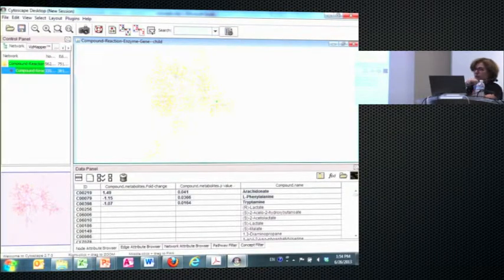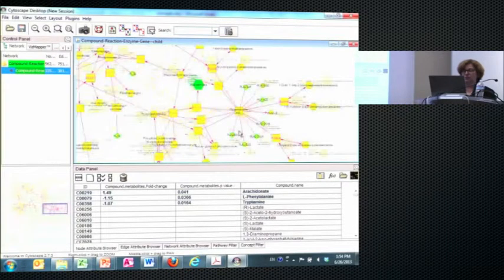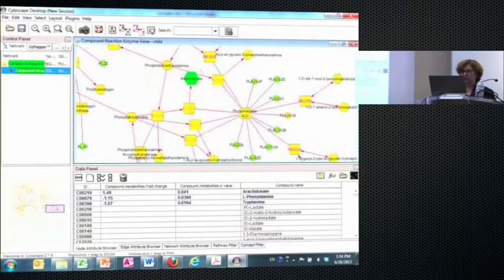One thing that I want to point out is that we don't visually represent in these networks the amount of the change. We tried that. So you can quickly tell that arachidonic acid is up, but from this, you cannot tell whether it's a 5-fold change or a 2-fold change or anything like that. We tried different options there, but it's extremely difficult to map fold change.